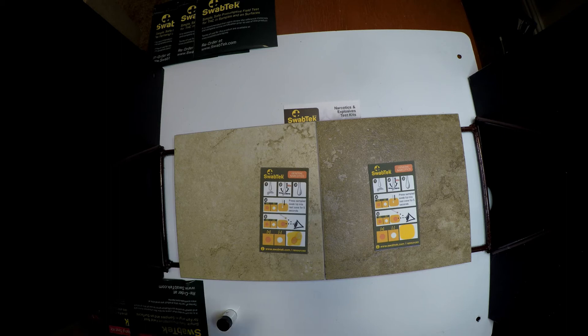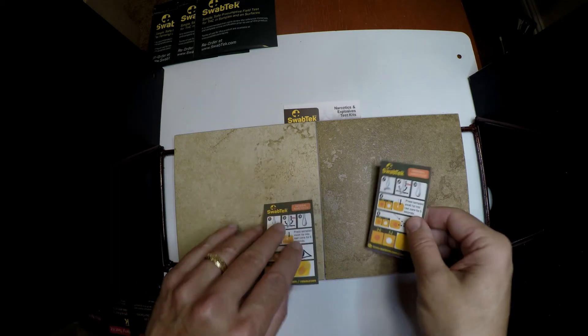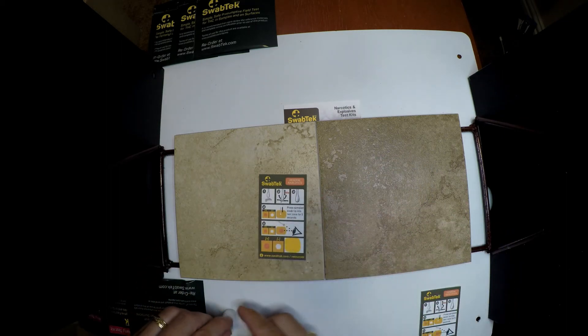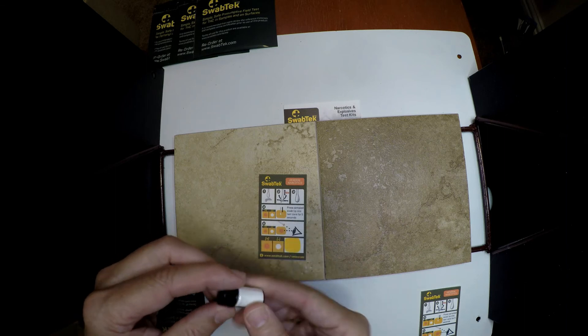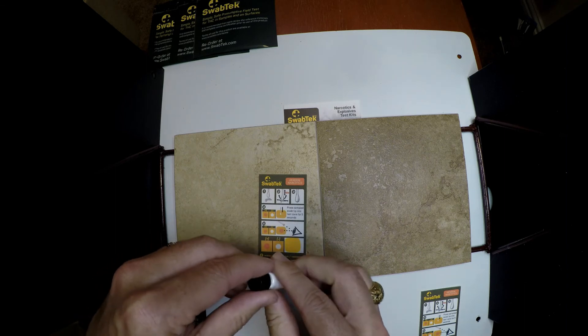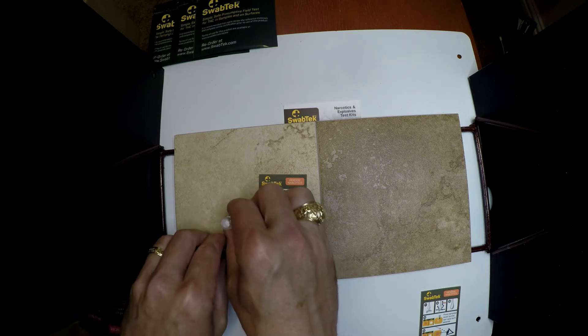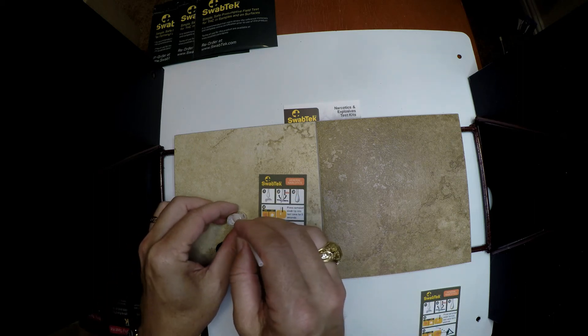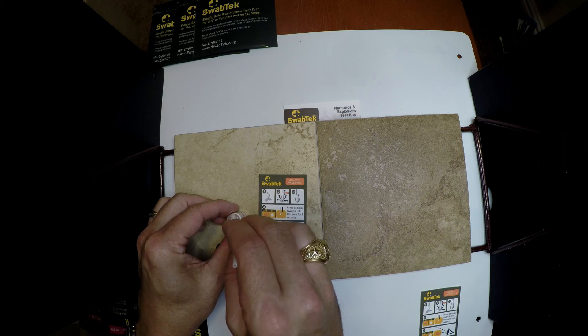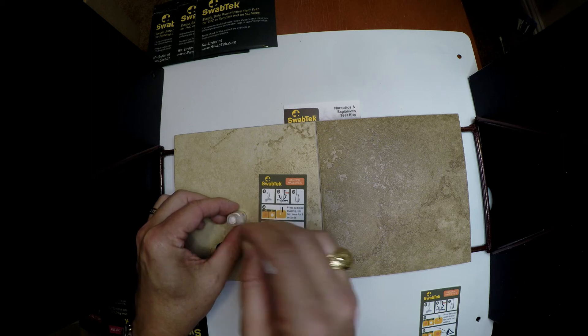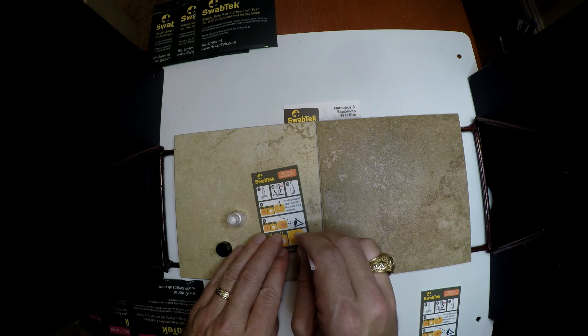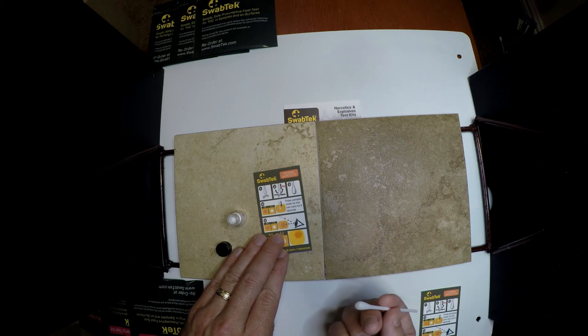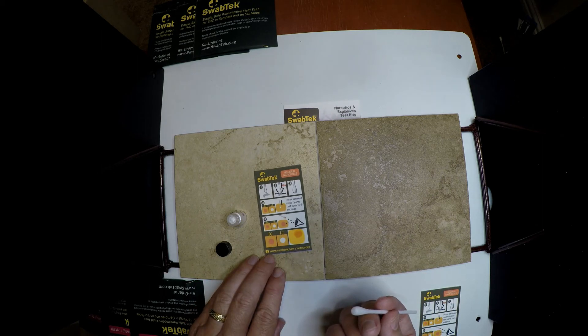If I'm doing general screening of passengers or cargo or something like that and I find something that's suspicious, like say this little bottle of white powder, I can open it. I can use the moist swab to just collect around the edge because the powder sticks to it, and then I can check.